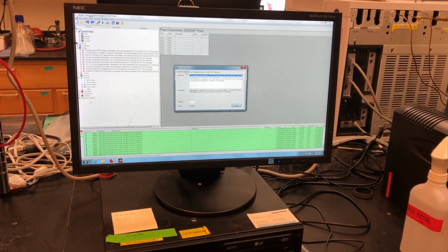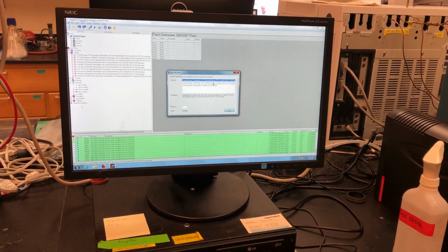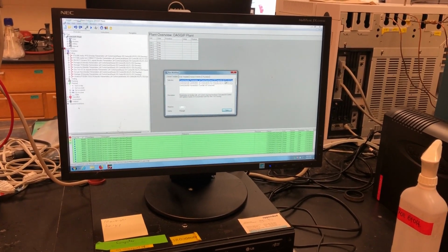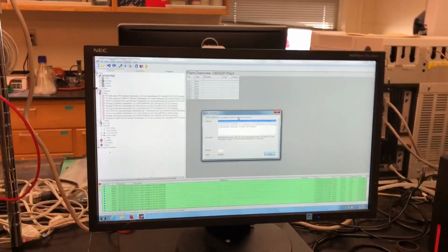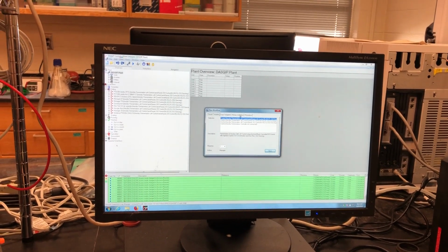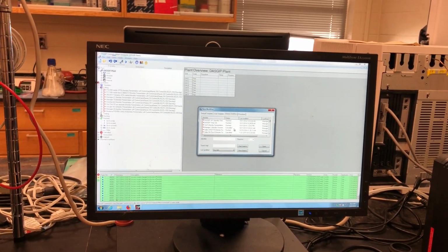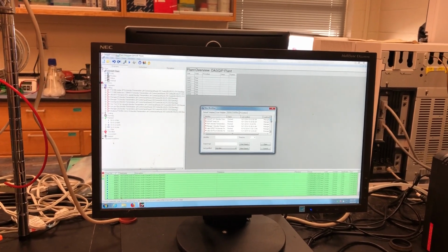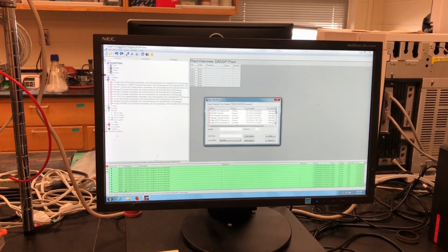Now, you can go with one of these default templates, and you just pick one based off the parameters you want. They have a short description on here saying what they are. If you have done a previous workflow that is similar to what you currently want to use, then you can go to Historic Workflow, and this will list all of the previous workflows that you've done before. This has all the same parameters as what you've done in the past.